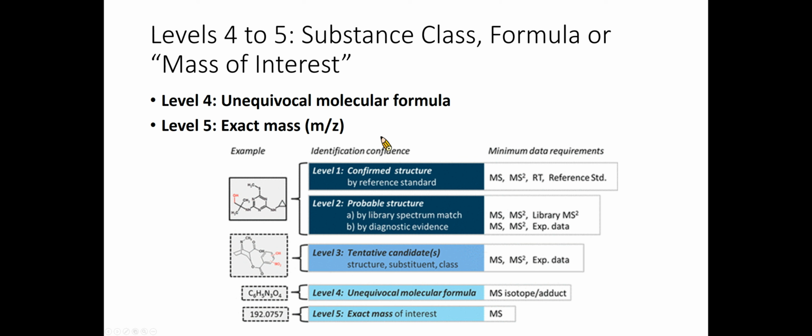It is even possible to record the mass of a level 5 mass and save it as an unknown spectrum in the database. This level should only apply to a few masses of specific interest, since it would be counterproductive to label all masses in a sample as level 5. Blank measurements should be used to ensure the substances do not arise from sample preparation or measurements.